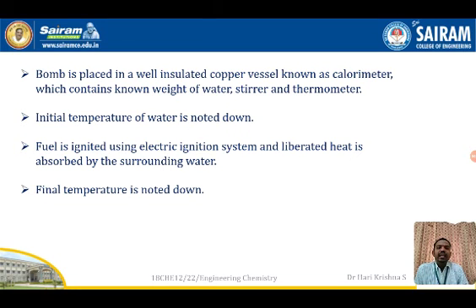The liberated heat will be absorbed by the surrounding water which is present around the bomb. Because of this, there will be a slow increase in the temperature of the water. We wait until the rise in temperature is constant.